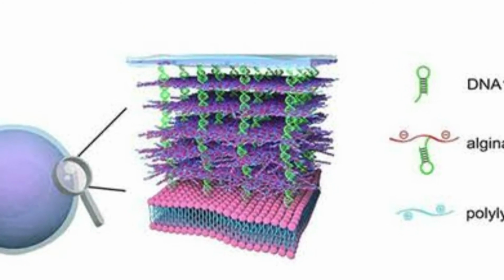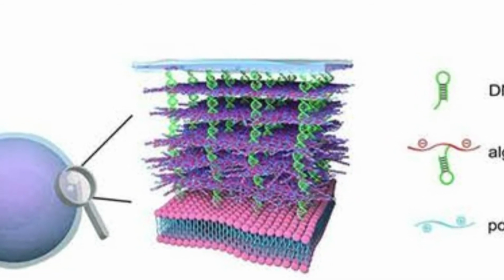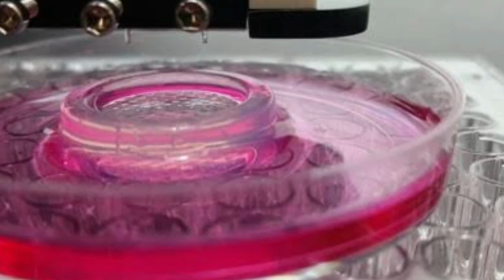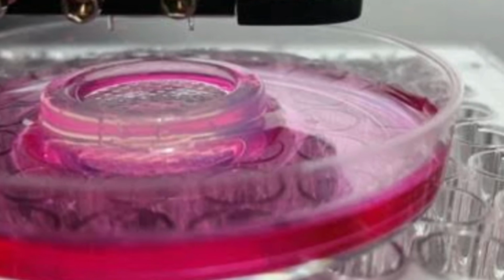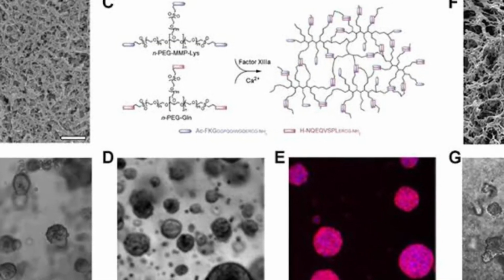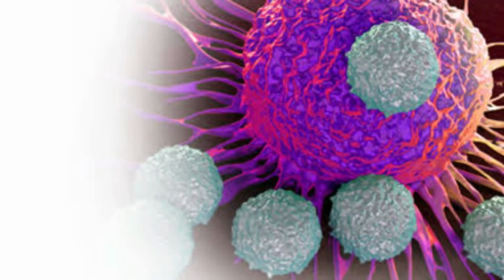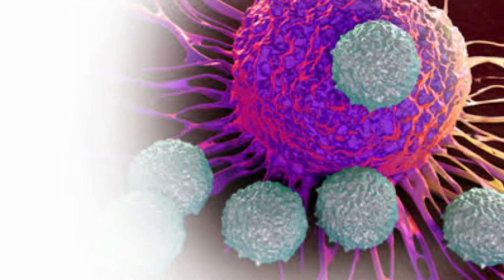We demonstrated for the first time that by controlling the location and distance between spheroids, we can mediate collective capillary sprouting, said Ozbolat. The researchers were able to create a matrix of spheroids with capillary sprouting in the desired directions. Capillaries are necessary for creation of tissues that can grow and continue to live. They are a means of delivering oxygen and nutrients to the cells, without which, cells will die. Without capillaries, only the outermost cells will receive oxygen and nutrients.